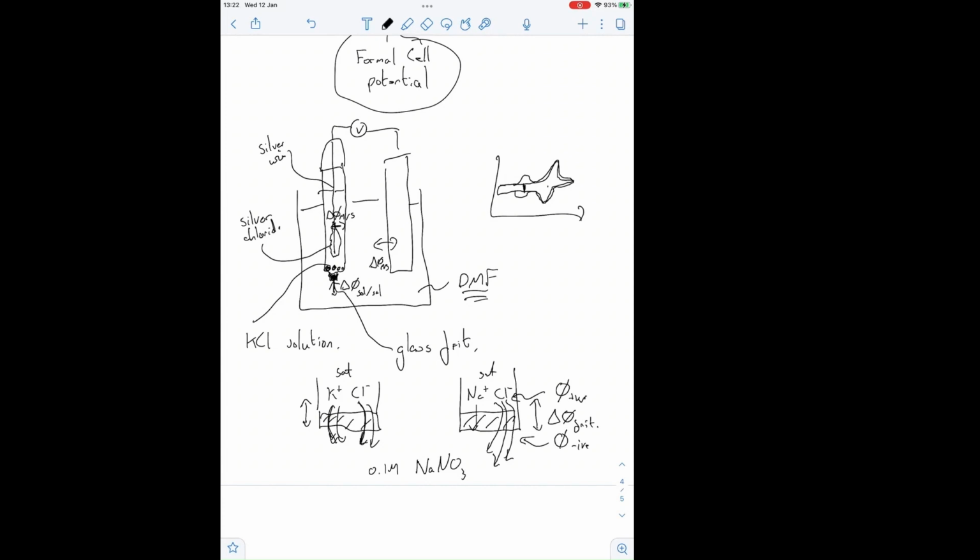So you've all used potassium chloride, but the reason you use potassium chloride, which old-fashioned electrochemists used to actually measure, they're called transport number measurements, and they were classic lab experiments, is so that you have as close to 0 potential difference across that glass frit.